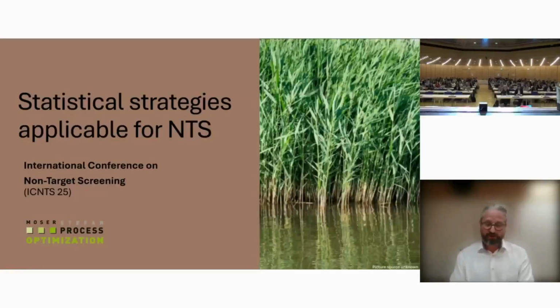Today, I'd like to take you on a short journey through how we structure, connect, and evaluate large LC-MS datasets, turning a flood of raw signals into clear, reproducible information. The image you see in the background is Phragmites australis, or common reed, our model system, a plant used in plant-based wastewater treatment that absorbs pollutants and acts like a living sensor. It's a perfect example of non-target screening, extracting meaning from patterns in a huge amount of complex data.